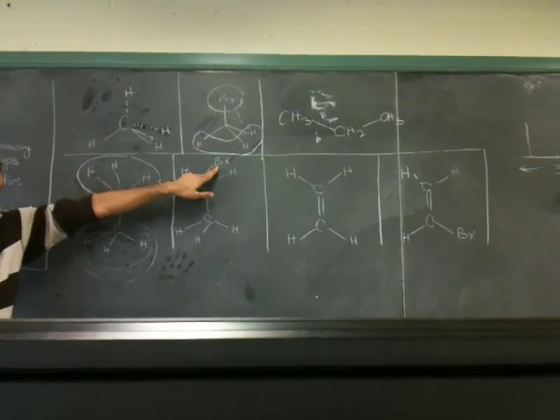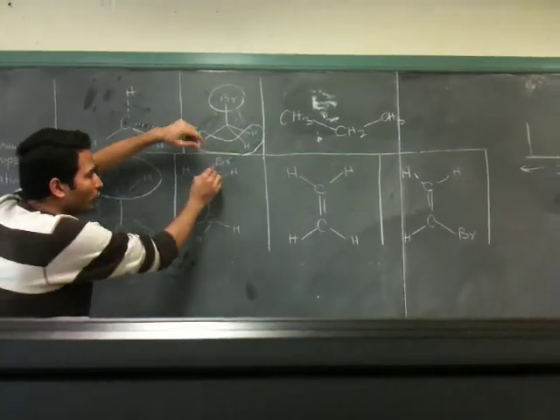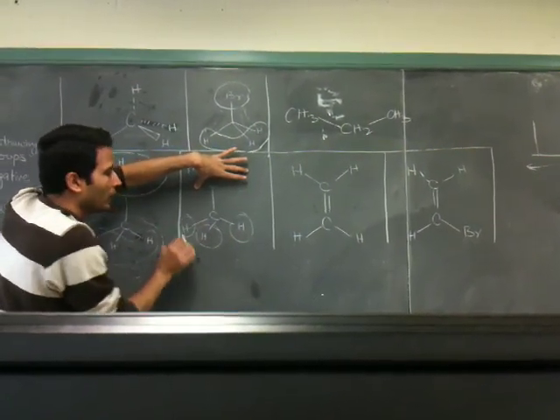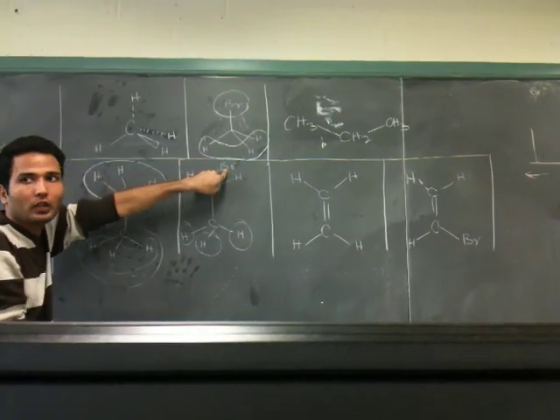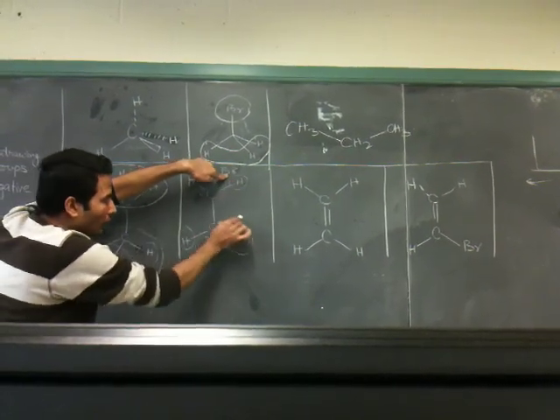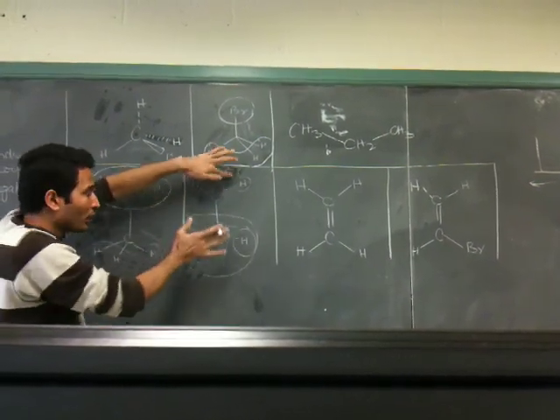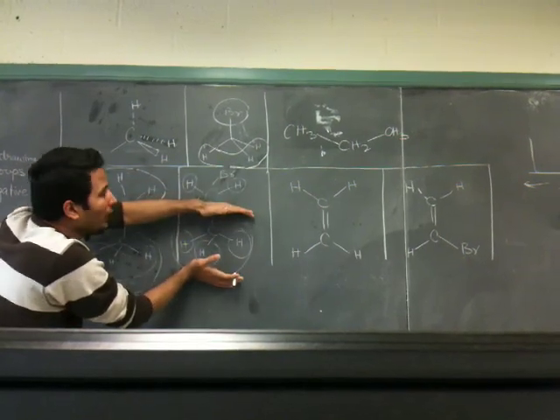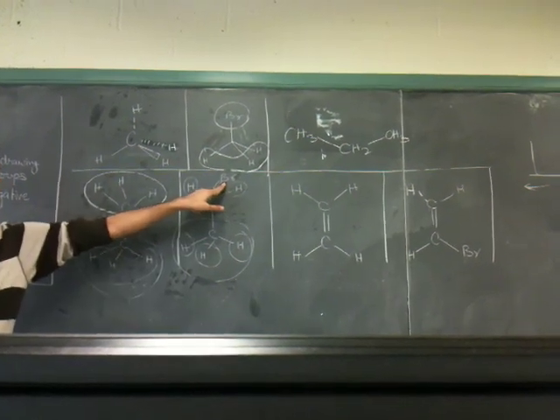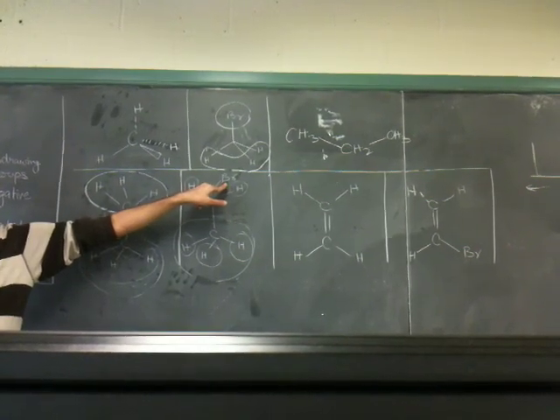Now, if I am changing one atom over here, what will happen? The force because of this group here will be equal on this, this and this. But now I have changed one atom over here. So whatever force this one feels because of this group will be the same as this one. But the force this group has put on this one is different from what this one is putting on the top, just because of this atom which has been changed here. Get what I'm saying? Any question?